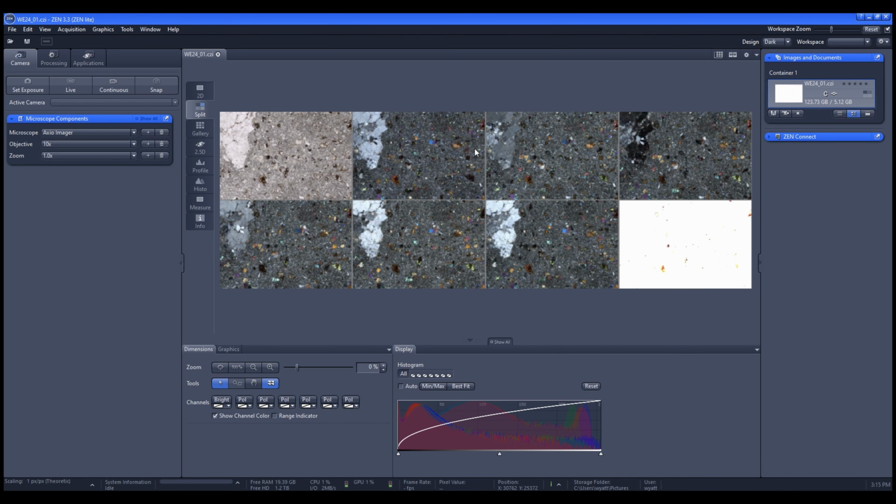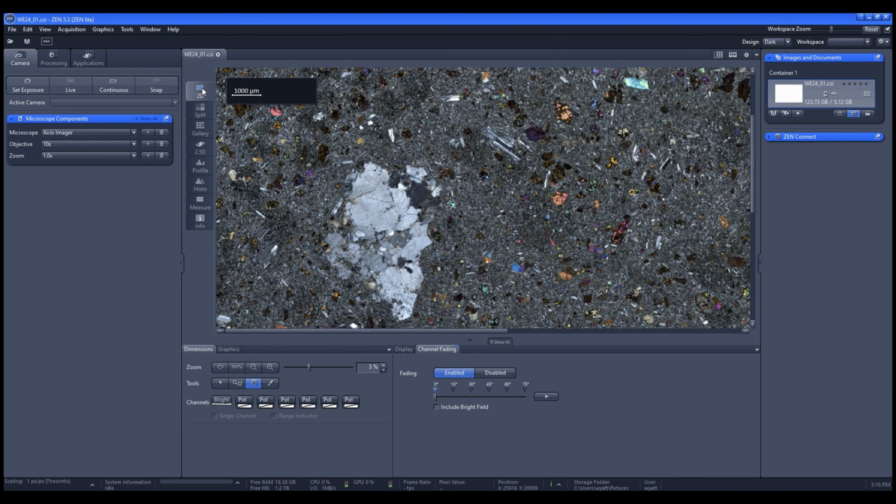cross-polarized light. And maybe in a future video, I can go more in depth, and it'd be really cool, but really expensive, if I could get a hold of my own microscope with a camera and show you that way. But that'll probably be a far future event. That would be really cool. But for the most part, I'm going to stick to XPL when I'm talking about minerals.